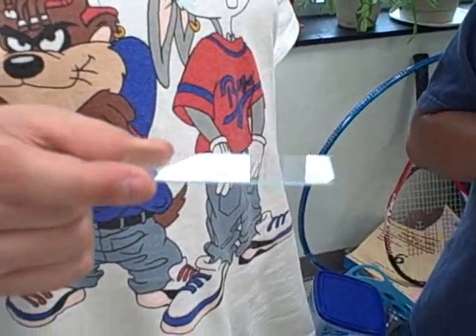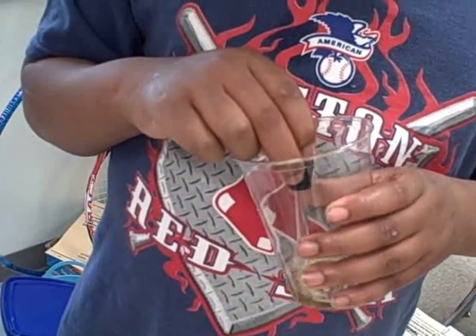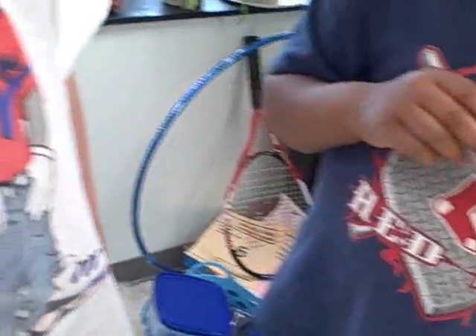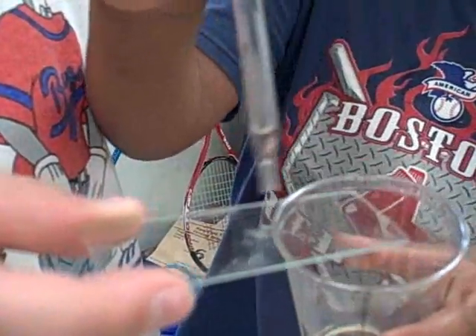Here's how you make a wet mount slide. You take a slide and a dropper full of pond water, and now you put one drop of pond water onto the slide. One drop.